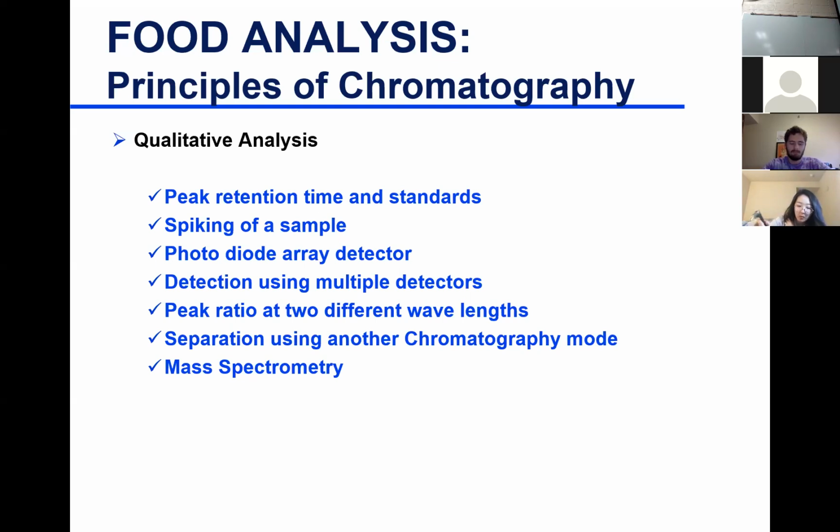Mass spectrometry is a more powerful detector than UV detection or refractive index detection. It gives me structural data. Gary is going to talk about MS Wednesday and Friday. It's not only going to give me molecular weight. Some powerful MSs can fragment and give you the molecular weight of the fragment. So you can get structural identification. What different functional groups you have, you can piece it together and identify your compound. It's a very powerful tool, and we'll have a lab on it.